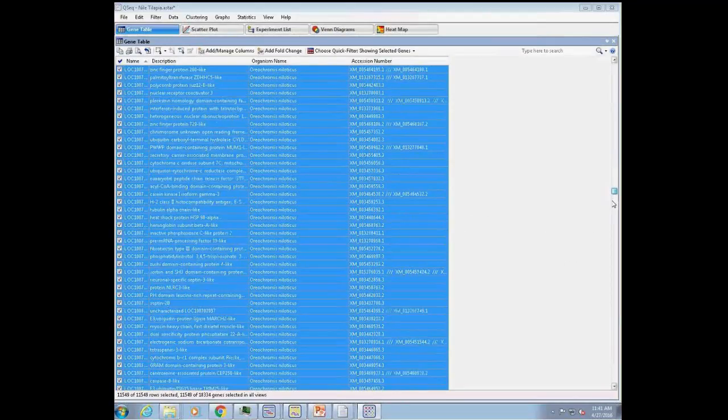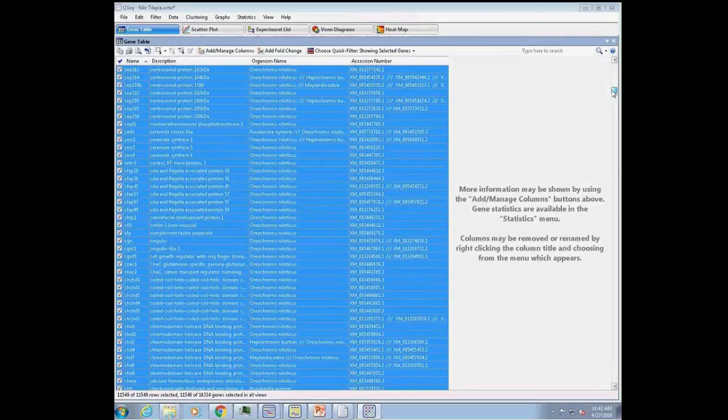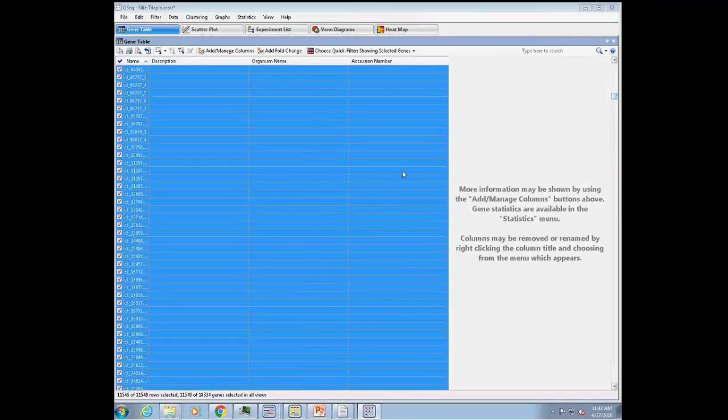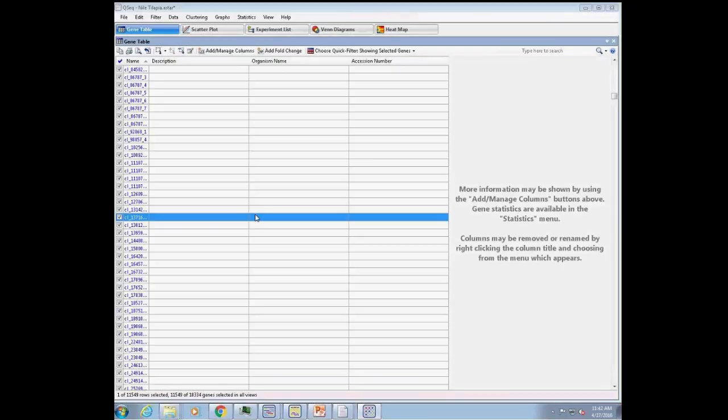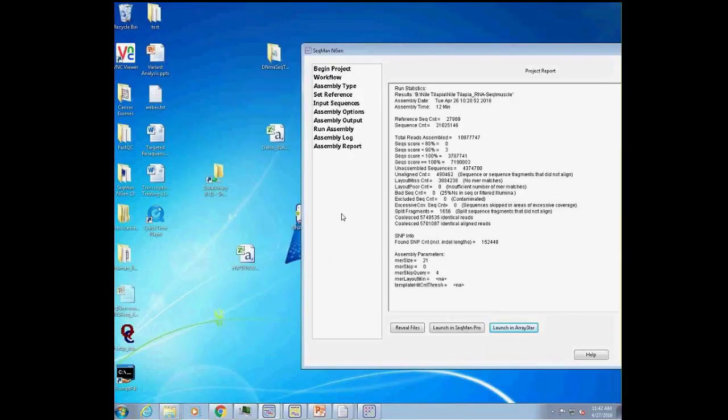And this is a question that came up with several people: some of these organisms are so novel that you really don't get very many database hits. I mean, that's a possibility. If you've got a very, very novel organism, and even the mRNA searches, if you relax the stringencies in the de novo assembly, you still have mostly novel, which is, again, possible. Then you have to have other means to annotate. And a common way is to do a BLASTX. And we don't have that built right now within our workflow. So the way that we do that is, let's see, we go back to this folder.